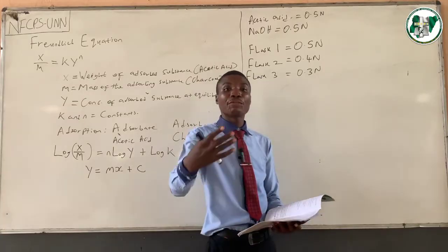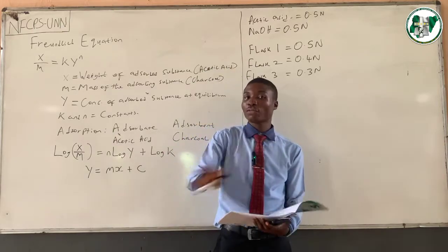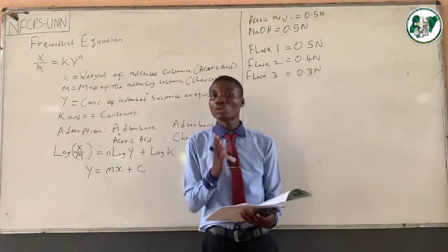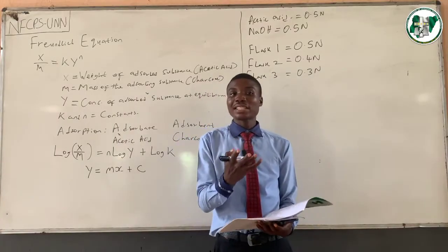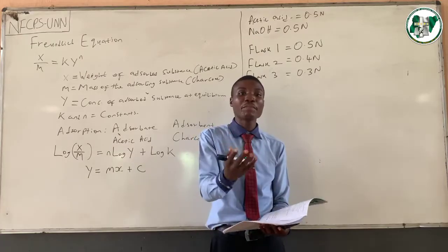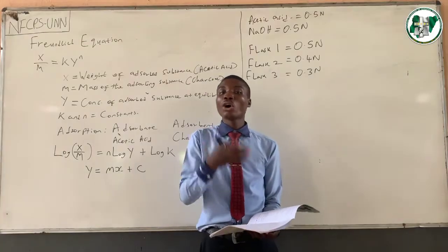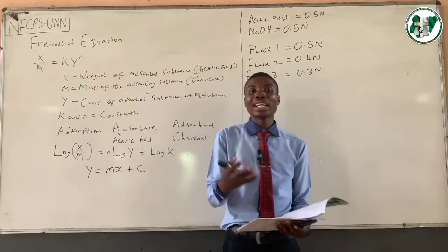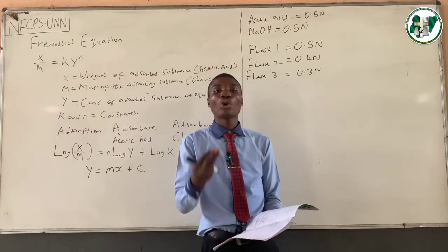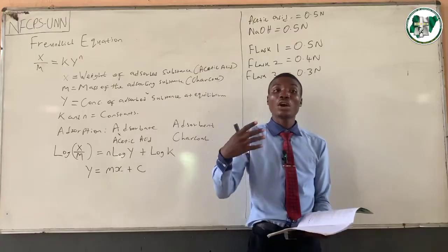So the other milliliters that follow afterwards will no longer be absorbed, because the paper has absorbed a sufficient quantity. That's exactly why you have to discard the first 5 ml, to ensure that the acetic acid absorbed by the filter paper will not interfere with your results. So the first 5 ml has limited acetic acid, you discard it, and for the other milliliters that follow, you know the acetic acid content is in order because the filter paper will no longer absorb more acetic acid while the filtration continues.